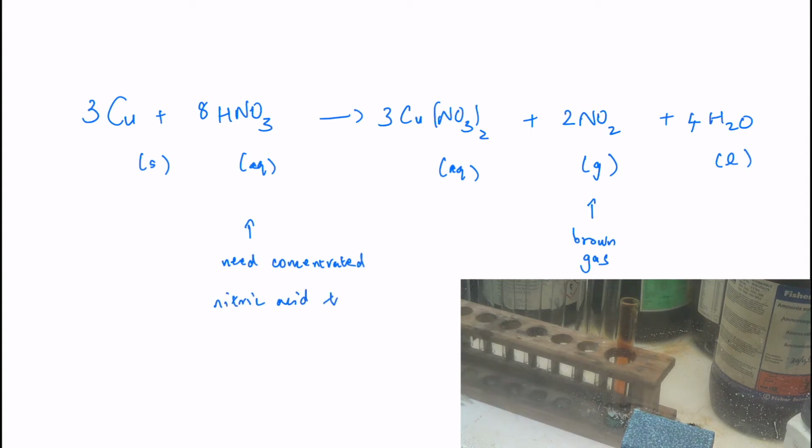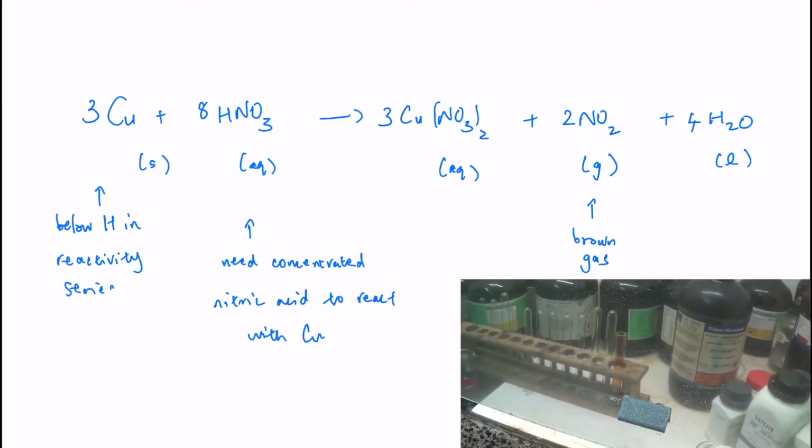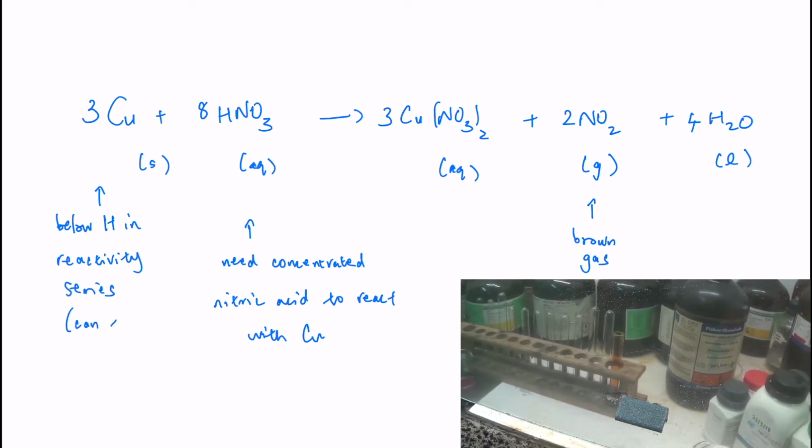There's a reaction between a concentrated acid and copper metal, even though copper is below hydrogen in the reactivity series, because concentrated acid is no longer under standard conditions. Okay, so I'll zoom out this thing. I'll leave this room for a bit, and when I return, we'll do a little bit more of other copper chemistry.